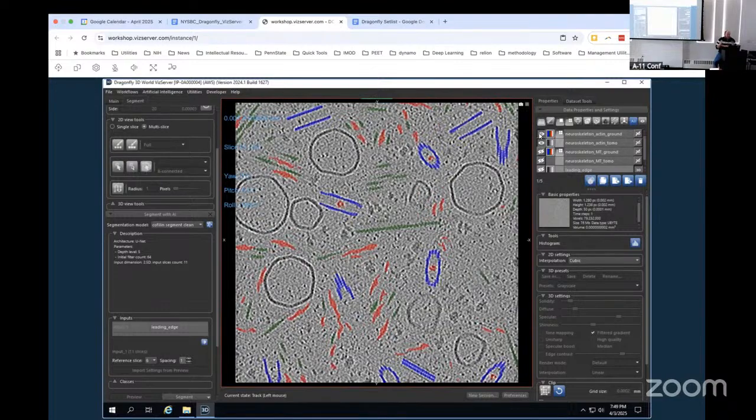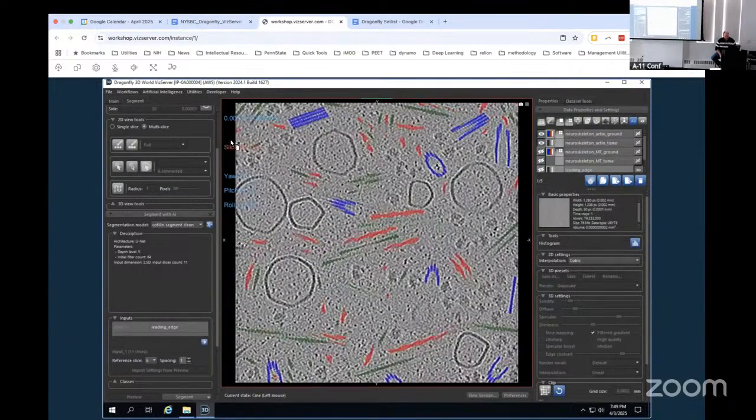Now, basically in CTS, even though there's like 50 different molecular species in this one tomogram, Carson has written it so that I can designate all of the ones that I want to be in the background class prior to generating the data set. And so here I was able to just say, give me all of the microtubules and actin and cofilactin.